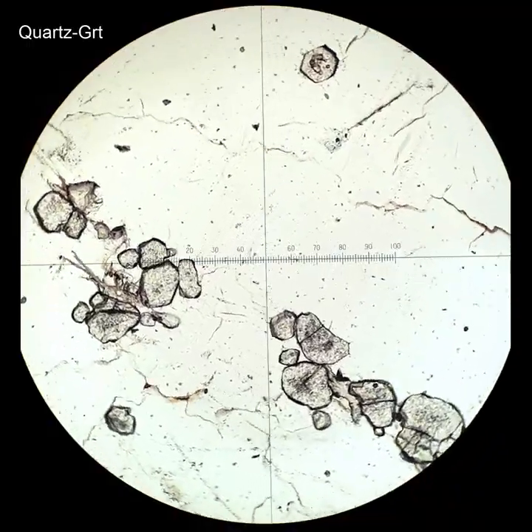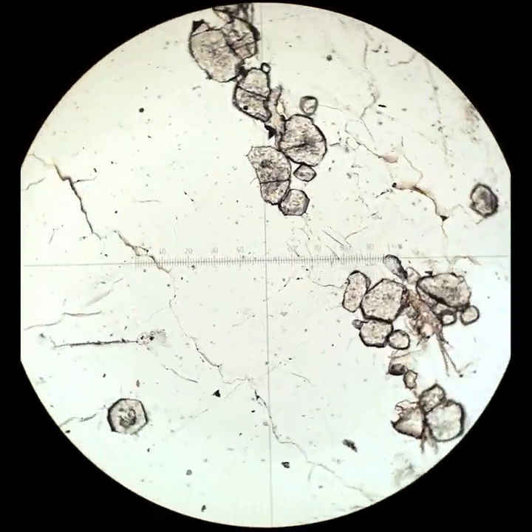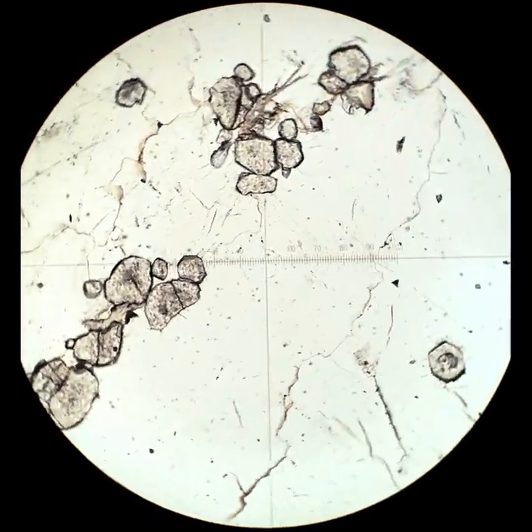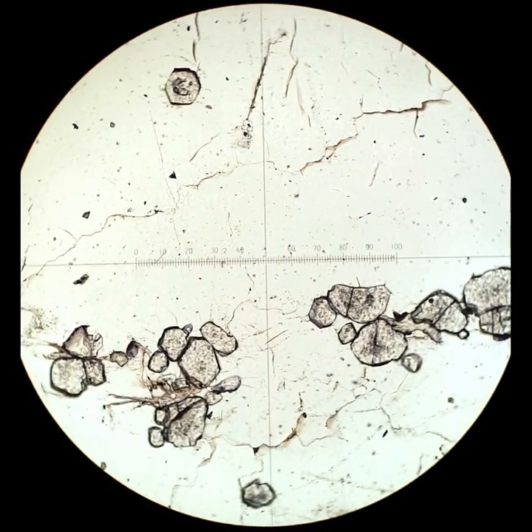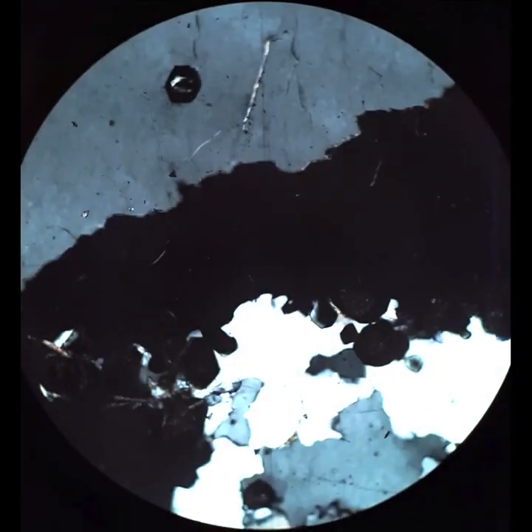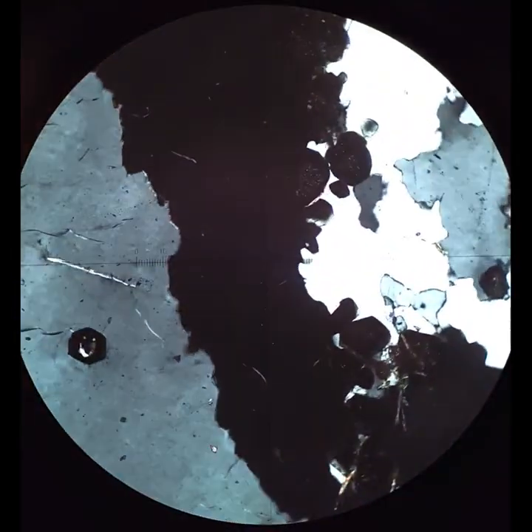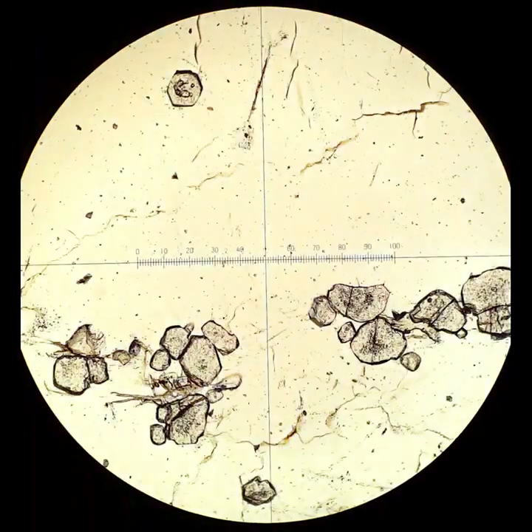This is quartz from a garnet quartzite, and I had to search through a lot of thin sections before I found one that shows these optical characteristics. When you cross the polars, this quartz looks almost completely black, isotropic, and that's because this particular grain has its C-axis pointing almost perpendicularly up out of the thin section. So the thin section cuts a nearly perfect circular cross-section through the uniaxial optical indicatrix of this grain. The other ones are much more typical, black and white.